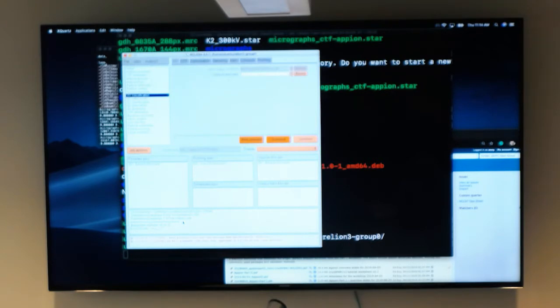Okay, so now if you click on here, it takes some time to run, but in here it'll show you what it's doing. This is not the calibrated pixel size, but it doesn't really matter for the tutorial. It'll take 5 minutes, or less. It really depends on your instance. It took me 9 minutes, which might only take you 4 minutes. When no one else was running it, it only took me 2 minutes.